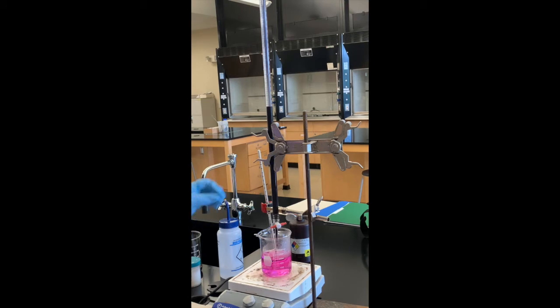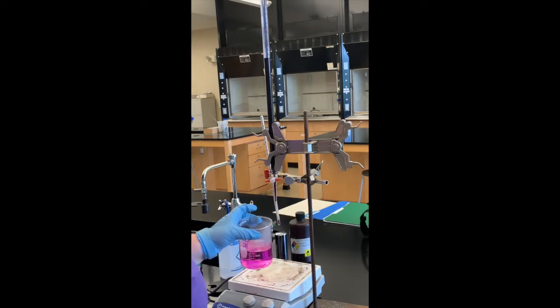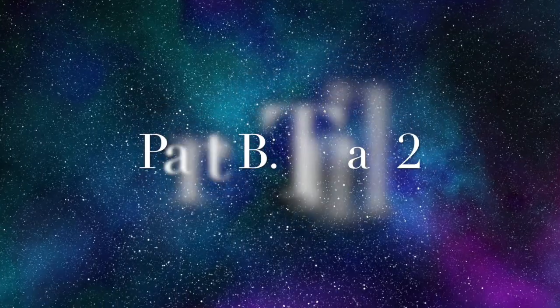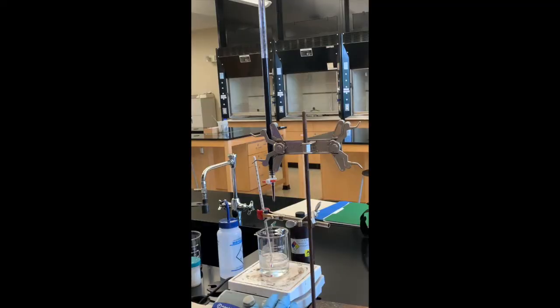Before I read the final volume I'm going to start heating up our solution for sample two. This first sample is going to go into a waste container and I'll start heating up sample two for Part B. The final volume for trial one of Part B is 25.59 milliliters. We'll let sample two heat up and when it's about 60 degrees we will titrate again.